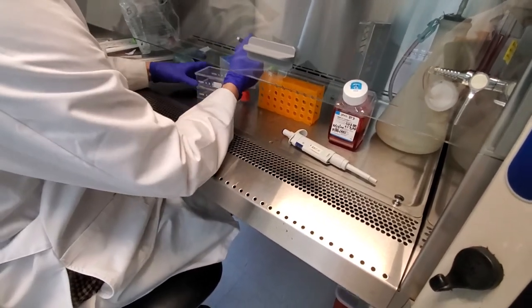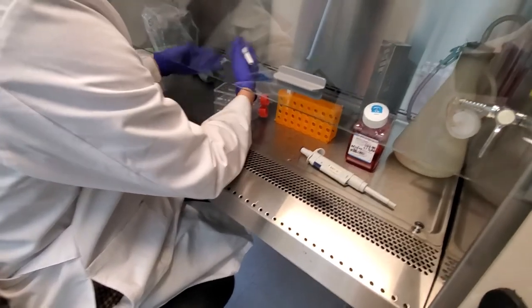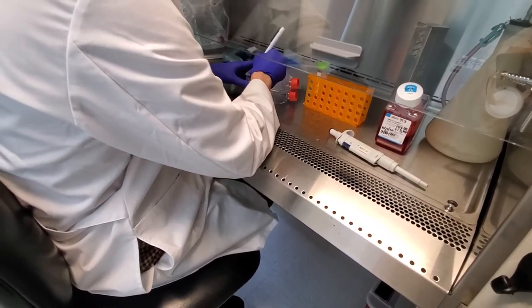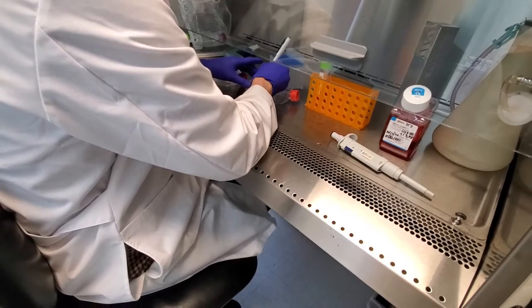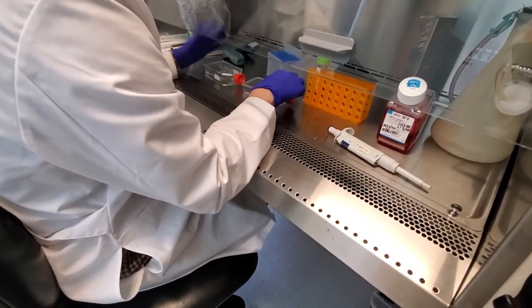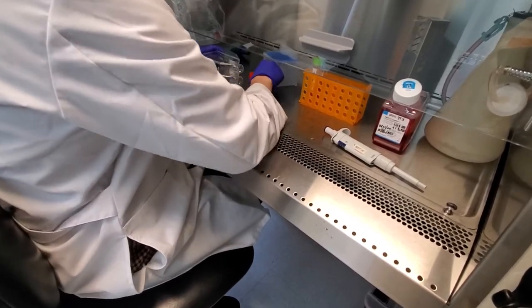So I'm just going to label these flasks. We can label on the side here. I just happen to do these on the top. And these were passage two. They were frozen, and we technically haven't passaged them again, so I keep them at passage two. And today's date. Let's put your initials on here for now. I typically do 10 mils media per flask in these T75s. Now you can have a little variation in that.